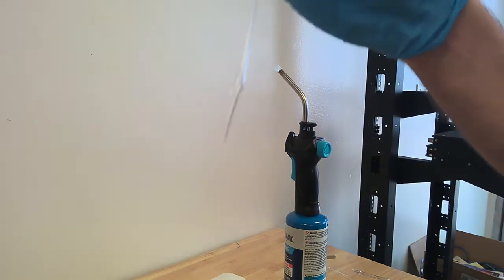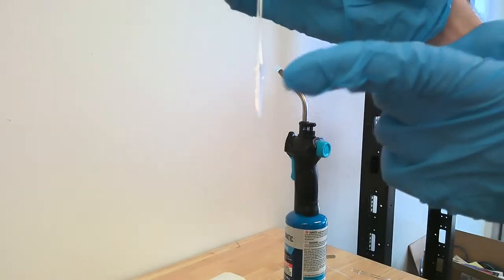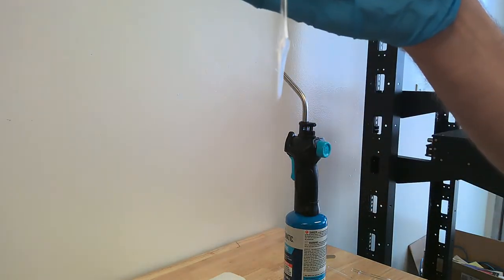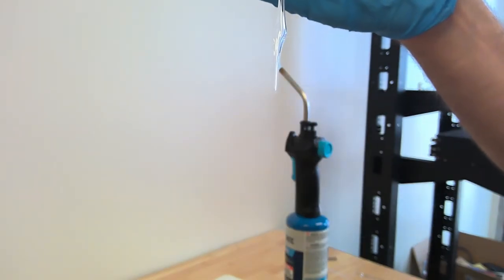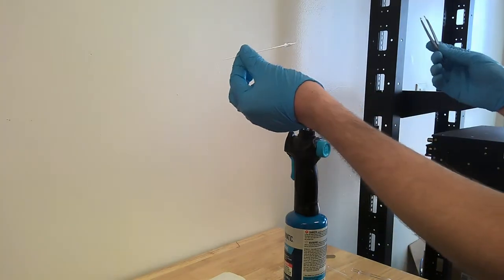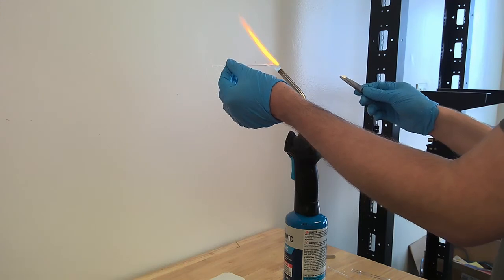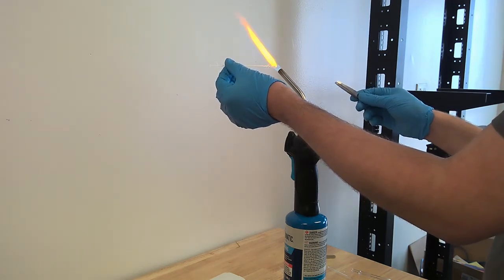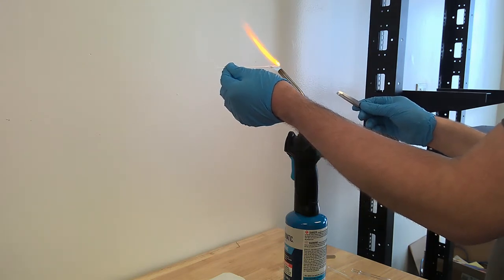So we have our precursor to our picnometer. Now we're going to taper off both ends of our picnometer and smooth out the glass ends on both sides. First and foremost, we're going to be really careful, and we're going to seal and taper off the bottom of our picnometer by very carefully sealing off the bottom using our flame.